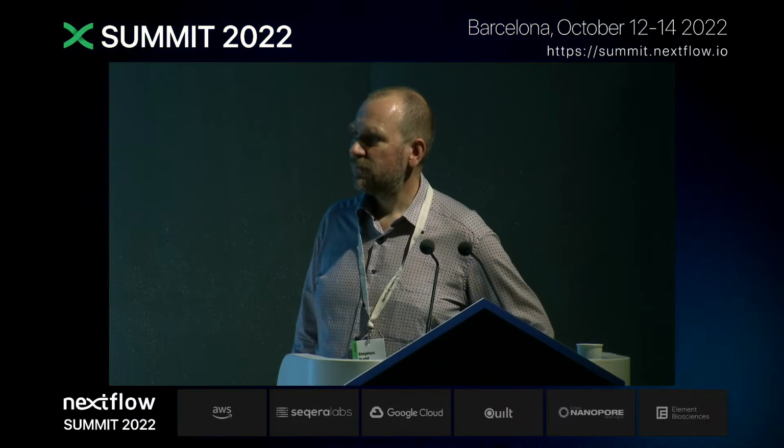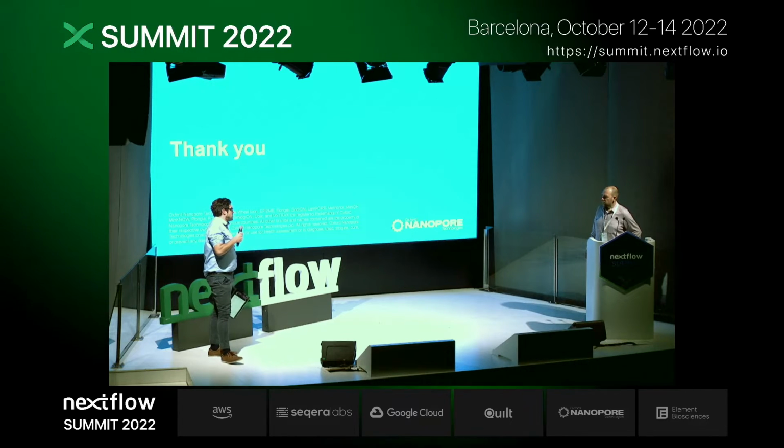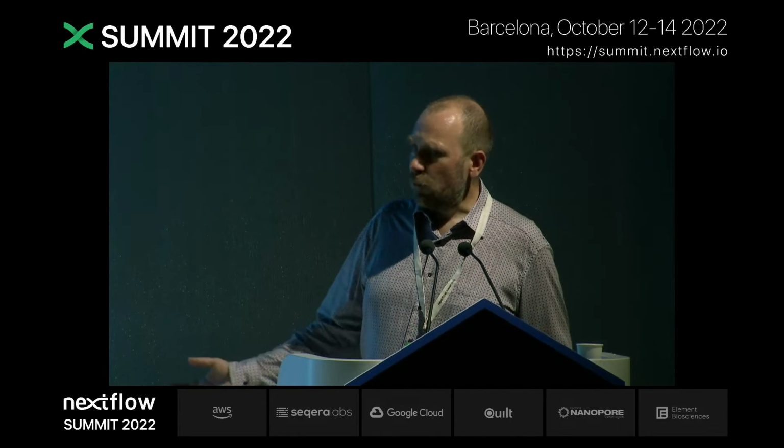Okay. And then where do you see this on the sequencer compute going over the next years? I mean, we saw a couple of weeks ago with Illumina's new machines that there's a lot of compute in there. Is that some sort of direction that you're thinking of going as well? Yes, of course. This is of course why we are developing these workflows. A lot of the sequencing devices have plenty of compute. There will be cases where users want to compute on device. There'll be other cases where they want to compute in the cloud. So we need a solution where you can compute wherever.